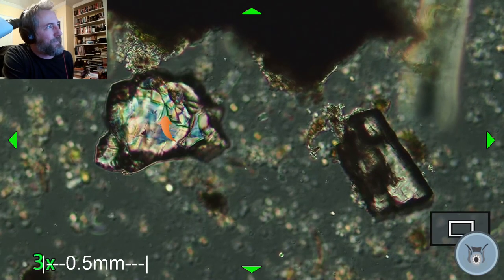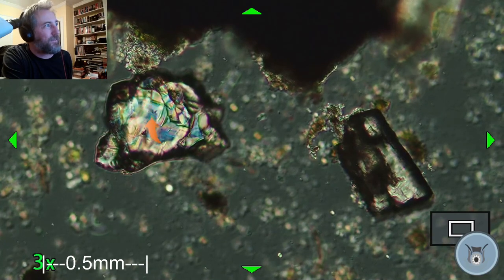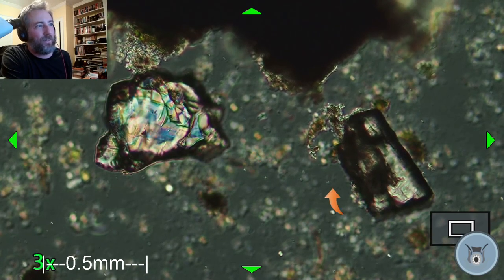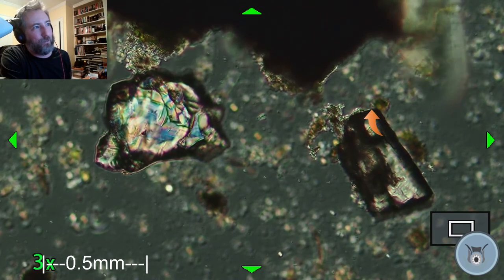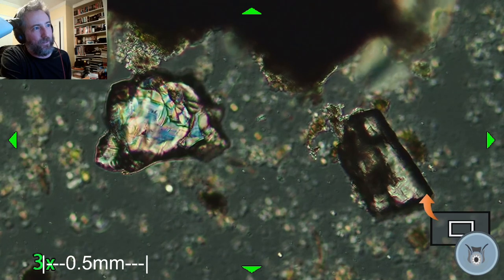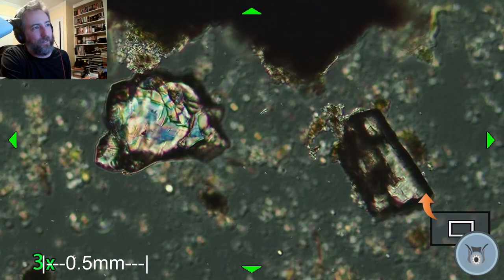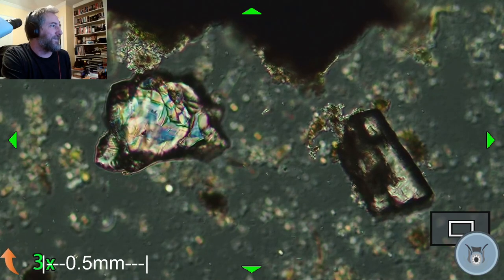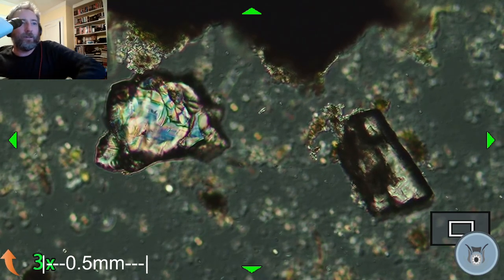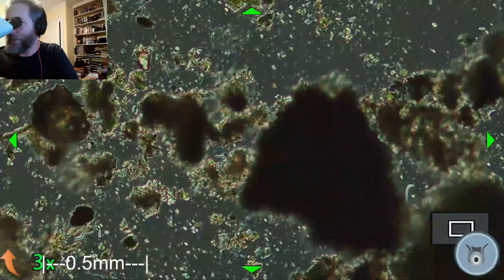And this is what we would call conchoidal fracturing, which makes me think this is probably quartz, because that's the way quartz breaks. This one actually has got straight edges, and these are cleavage planes probably, because they're straight on both sides, and there's a straight bar in the middle, and then it looks like they break off at the same angle here. So probably some feldspar. Can't guarantee it, but would be my guess.